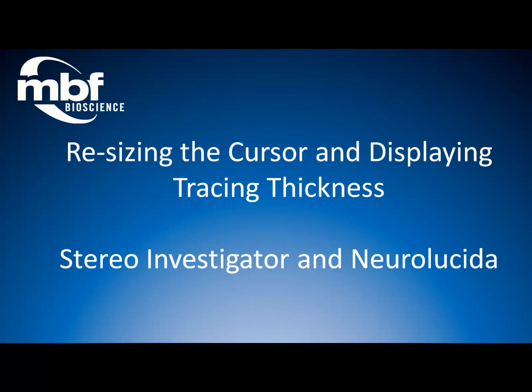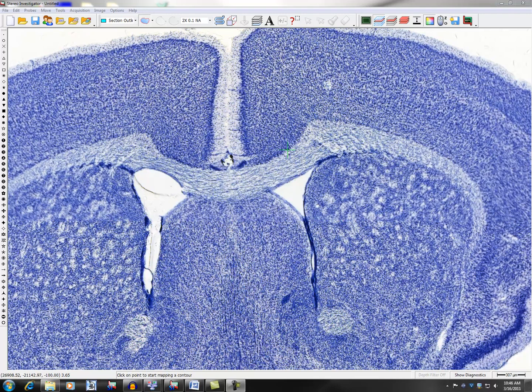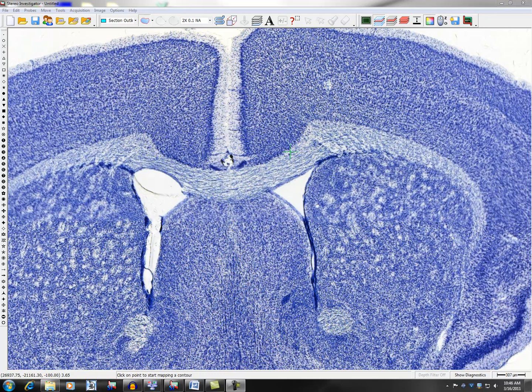Resizing the cursor and displaying tracing thickness in Stereo Investigator and Neurolucida version 10. Displaying tracing thickness is useful when your contour changes in size, for example when tracing neurons.